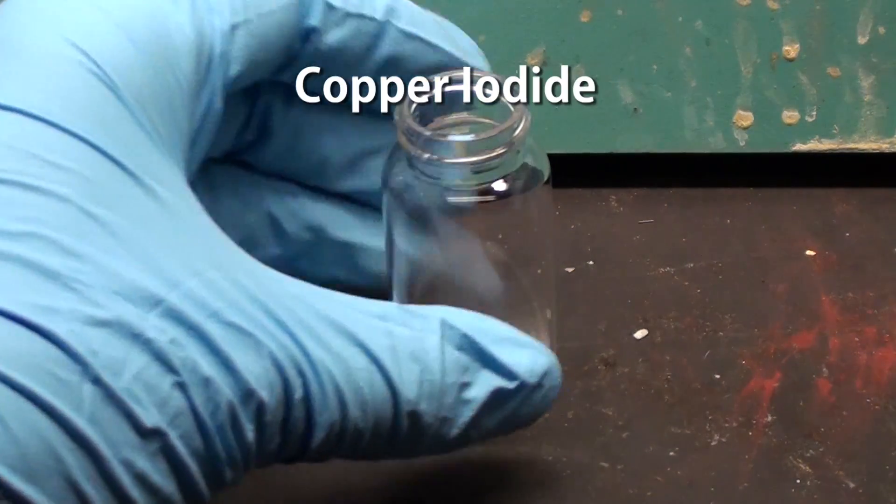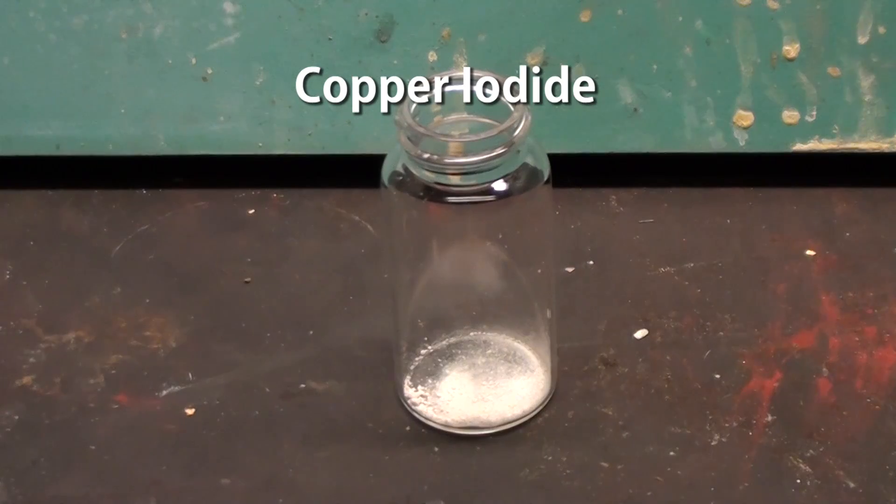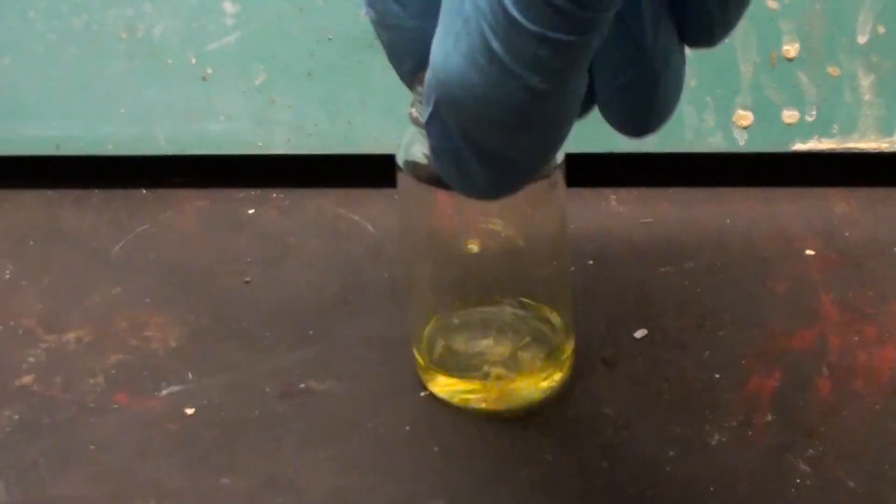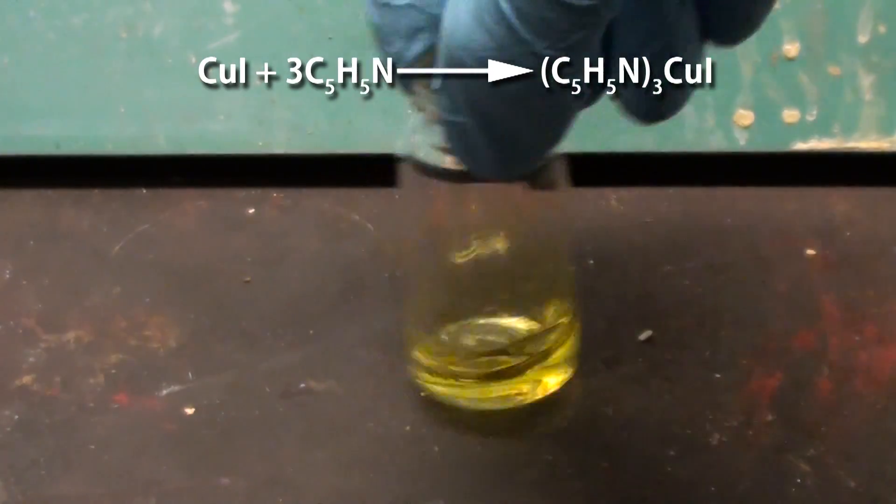First, get a small quantity of copper iodide, about 20mg or so, and then add enough pyridine to dissolve it. It'll form a yellow solution of tris-pyridine copper iodide.